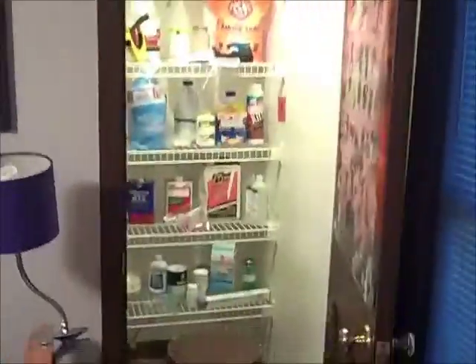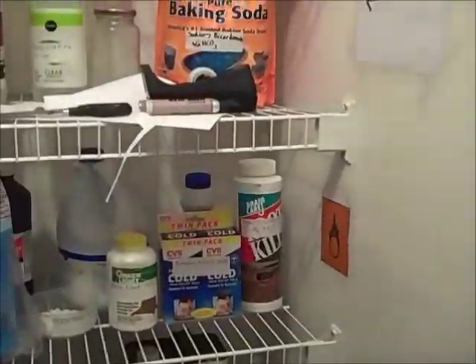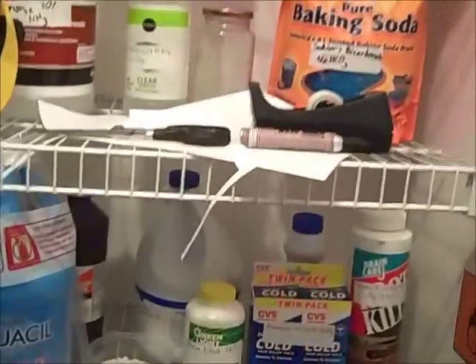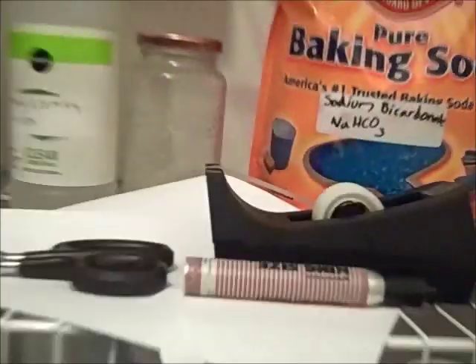First and most obvious is my back closet, which contains all the chemicals. I segregate them on different shelves by type: acids at the top, bases on the second drawer, which are both corrosive, oxidizers in the middle, flammables on the second to last drawer, and relatively non-hazardous chemicals near the bottom. I intend to sooner or later put cardboard all across these shelves so the acid doesn't drip on the base or something, but right now this is how I operate as far as organization. All of the chemicals are clearly labeled for the most part, but yeah. We begin with my shelf that contains acids.